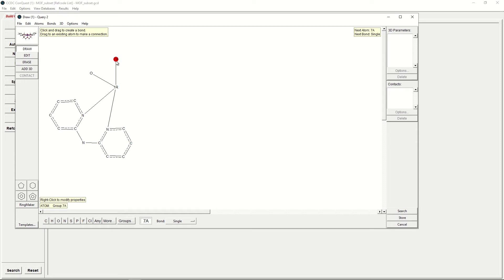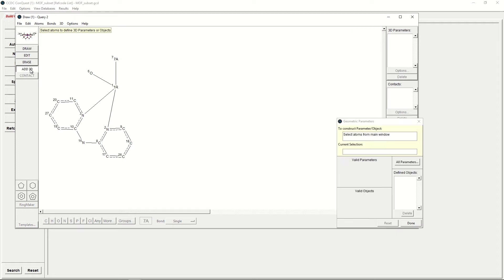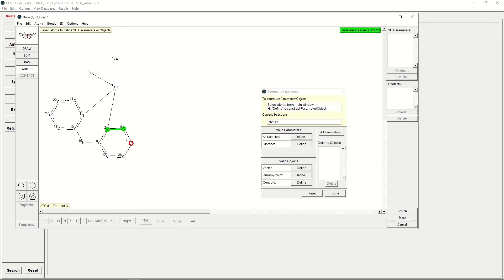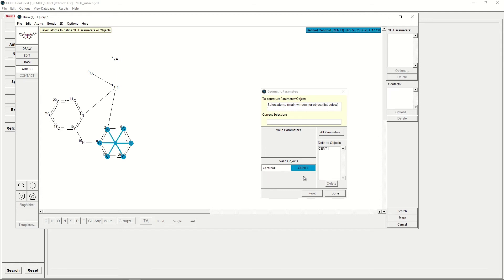Now that we've done this, we would like to know the distance between the centroids of each of these two rings. First, we will click Add 3D, and we will find the centroids of the rings. We will do this by clicking on each of the atoms in turn within one of the rings. I will start with the N2 ring, so we will click on all six atoms here. Once we have done this, in the Geometric Parameters window, we will click Centroid, Define. This defines the centroid of this ring as Cent1.